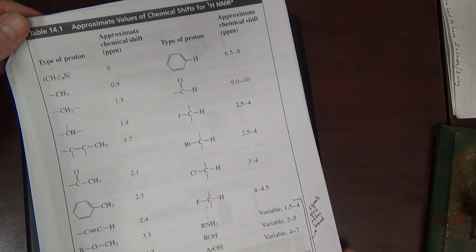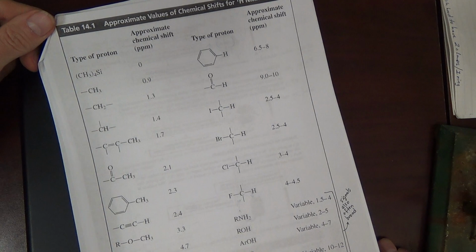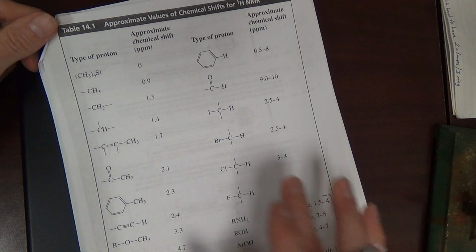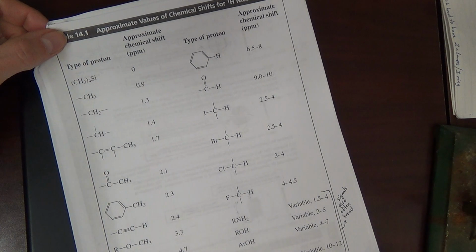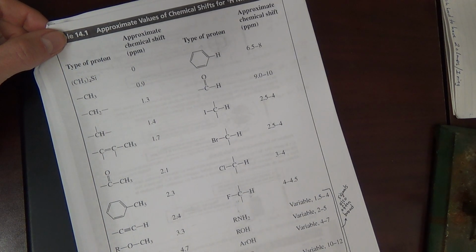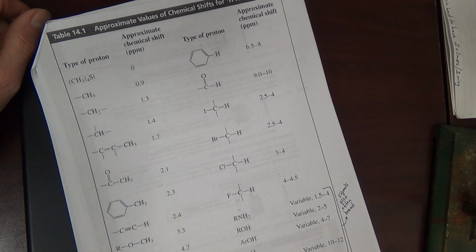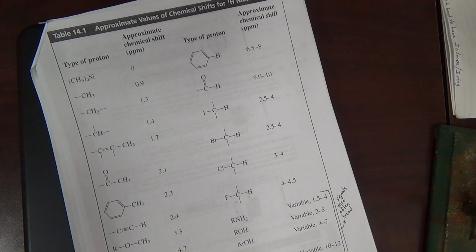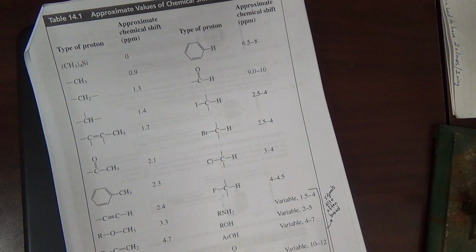Here's another table. This table is pretty much just for your reference. I think we've covered most of the general positions. Some of this is repeat, like the variability of these guys. You have to learn to what extent you need to know your peak positions, but you also dealt with this with IR. Ultimately, you need to be able to work problems and use NMR as opposed to memorizing every peak position. So some of this can be just for reference for you to look at as needed.